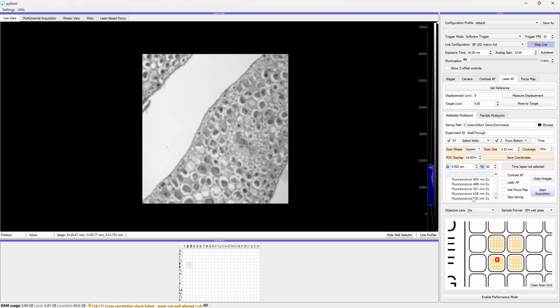So now the behavior that we'll see when we collect these Z stacks is it's going to visit each of these fields of view. It's going to, again, center on the XY. It's going to then employ the laser autofocus to find the Z. The Z is going to be the bottom of the Z stack that we take. And then it's going to go through and take images starting at that bottom Z and collect 60 Z slices at a Z step size of 1/2 micron.